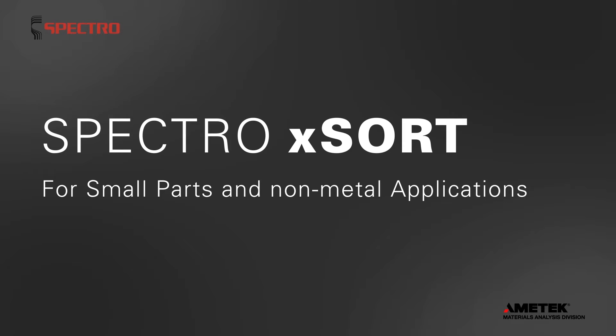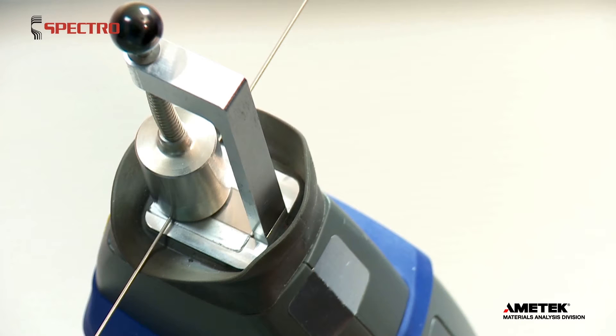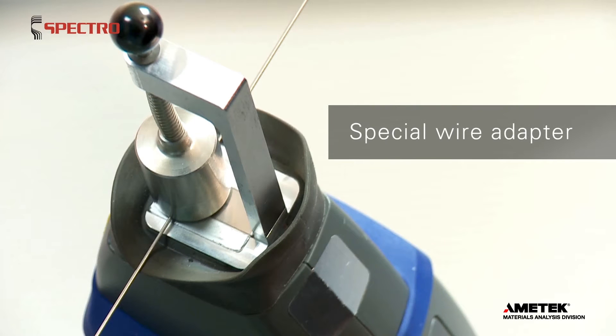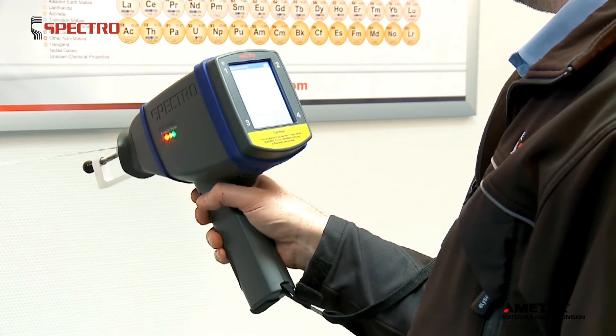Spectro XSort for small parts and non-metal applications. A special adapter centers samples such as wire in XSort's beam aperture. You get accurate, reliable readings on wires down to 1 mm in diameter.